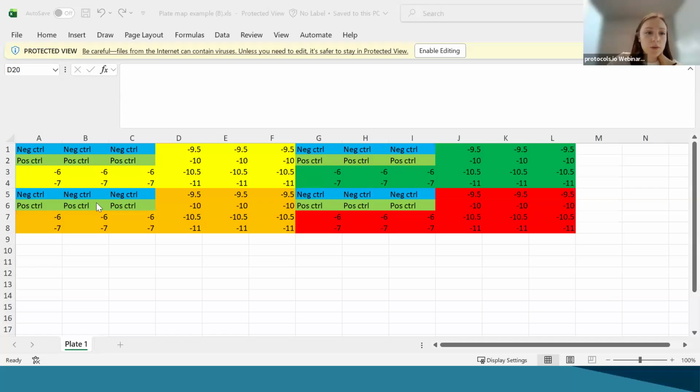There you go, Sergio. So you can see in here, if we think back to that plate map, you've got the negative controls, the positive controls, the information all stored in the cells. So it's relatively straightforward. It's pulled all of this text across and it's automatically detected the size of the well plate map and created that for you, but it hasn't pulled across the colors here.